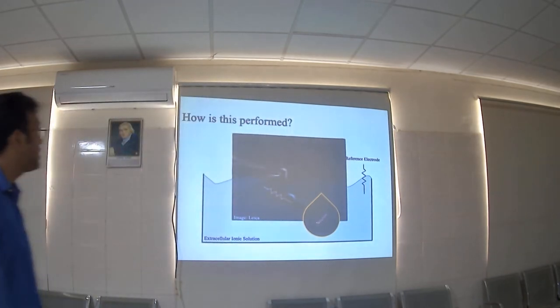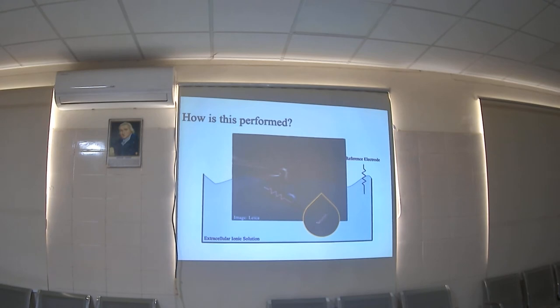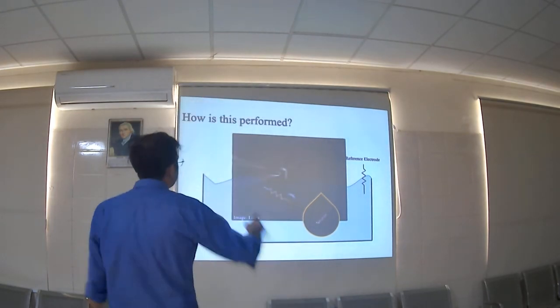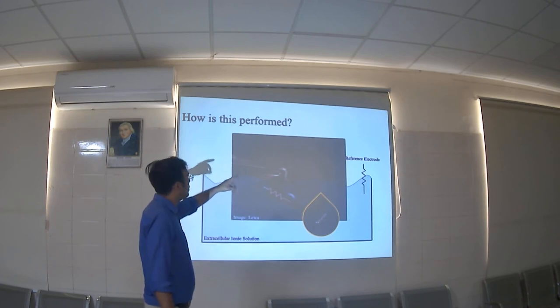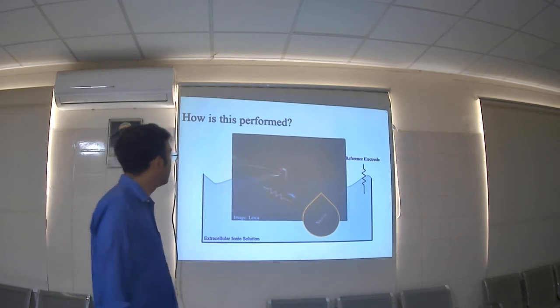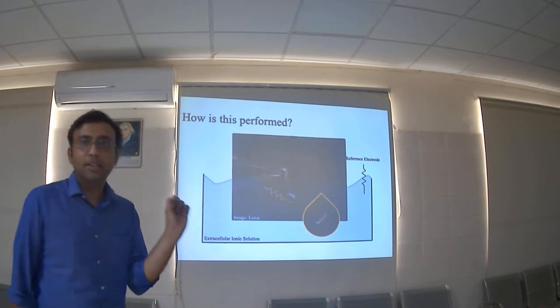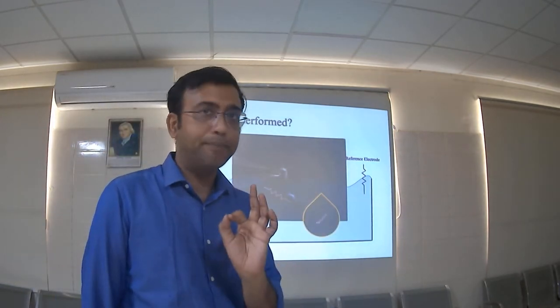So this is actually, it's not clear, right? It's clear. Can you see the neuron? I don't know. Actually, this is a neuron. आप देख सकते हैं कि this is one neuron. How it is looked? किस तरह से आप neuron के अंदर, this is a microscopic image. It's not clear here, right? कि actually एक micromanipulator neuron के अंदर जाके then you patch it, and there are different techniques कि किस तरह से आप वो करते हैं.